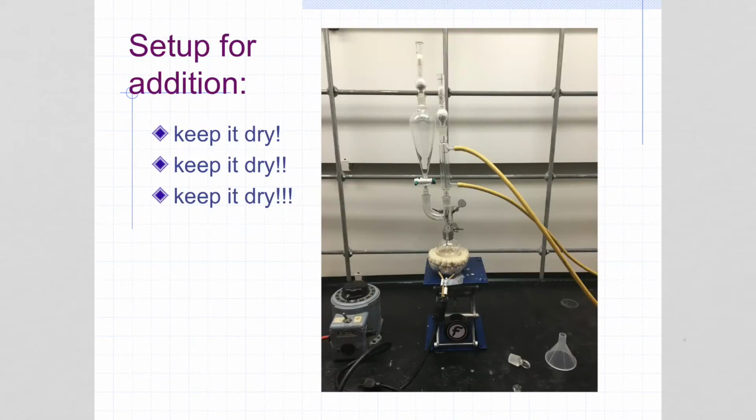Here's an example of what the apparatus is going to look like in real life. It's exactly the same. The only thing that is different is this week we won't be using the heating mantle, we'll just be using an ice bath. Also, one of the things that's different from the drawing is here you can see the calcium chloride packed drying tubes. They keep the reaction from being a closed system, but they also help dry out any air that might come into the reaction.